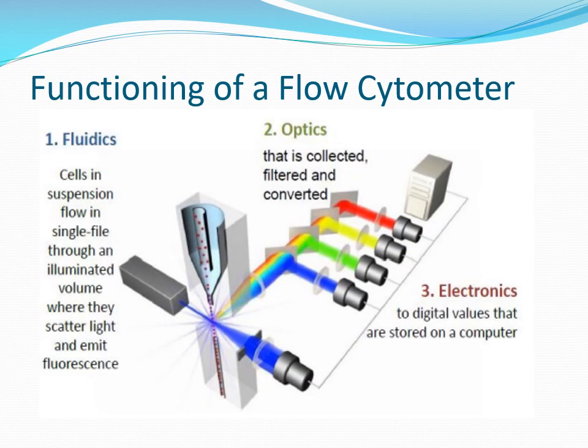For the functioning of this flow cytometer, there are three major parts. First, the cells should pass the laser beam. This is possible because of the fluidic system wherein the cells flow in a single file, and at the interrogation point the incident laser beam is scattered by these cells which pass this point one at a time.